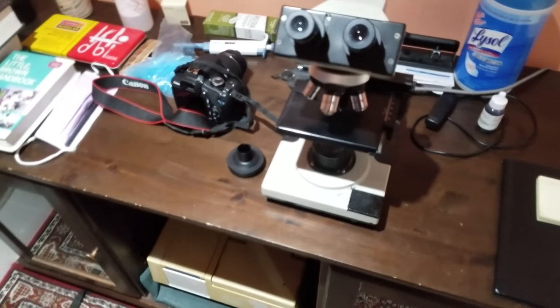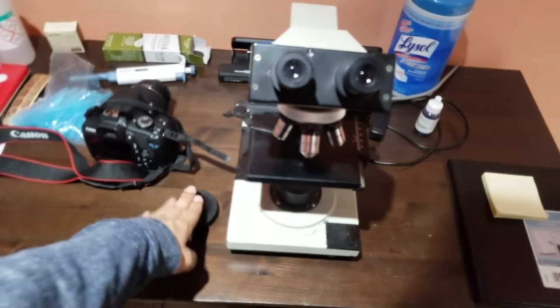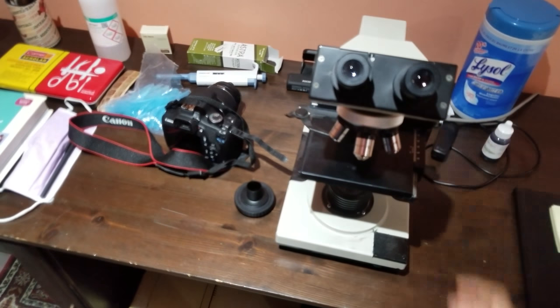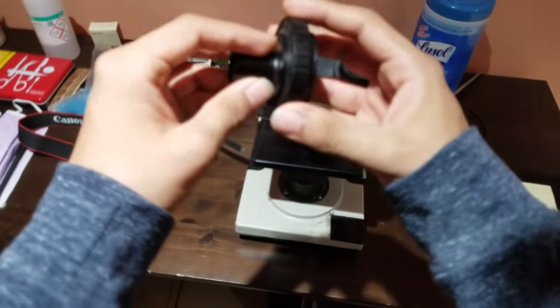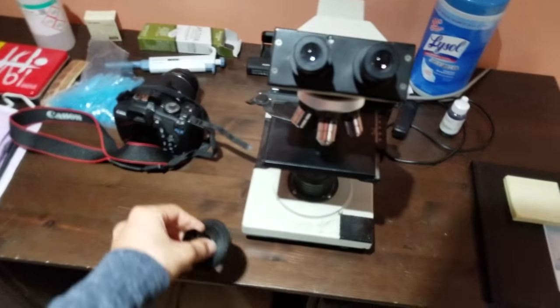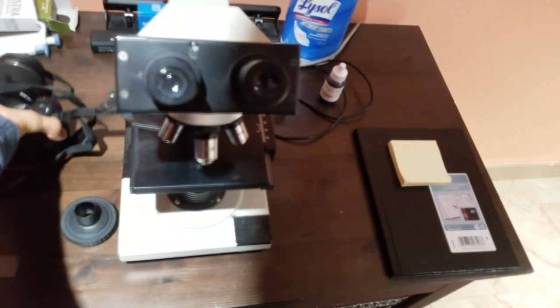Okay, so in this video, I'm going to be showing you how to use a microscope camera, or rather a microscope camera adapter. So the equipment that we will need is number one, our microscope, number two, a T adapter that fits the microscope, and you can buy these on eBay or Amazon. And finally, we're going to need a camera that fits the T adapter.